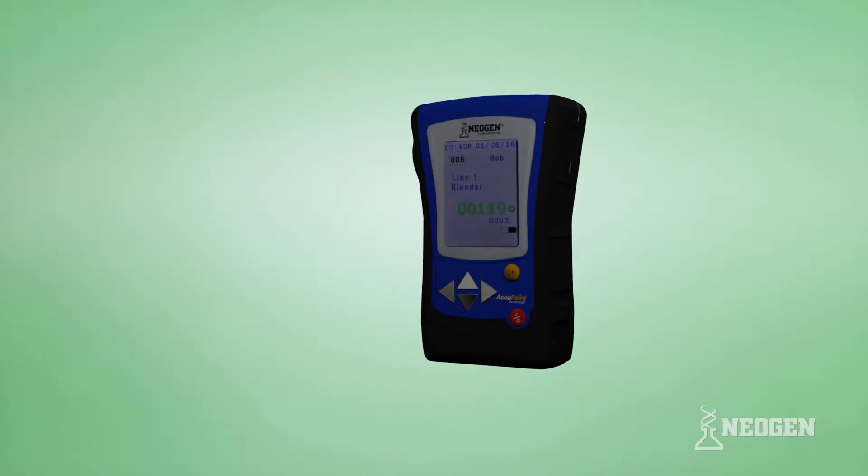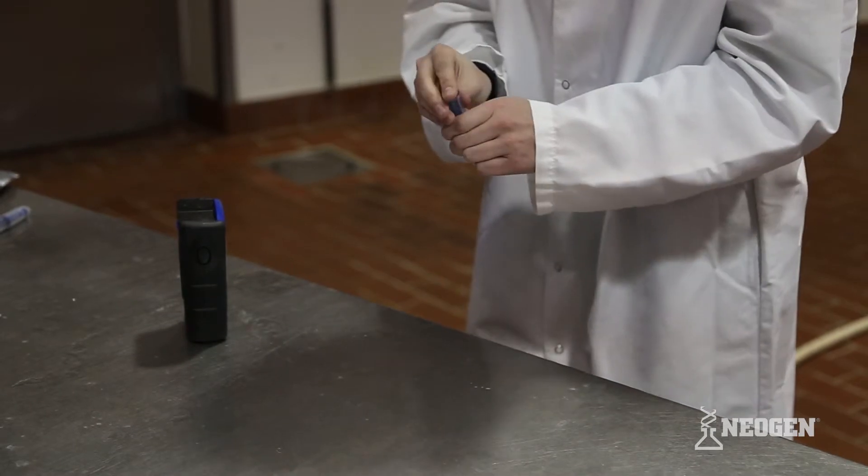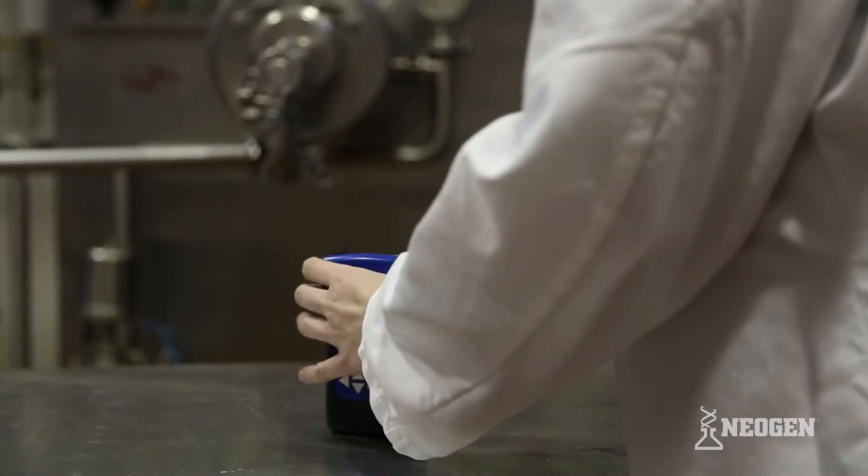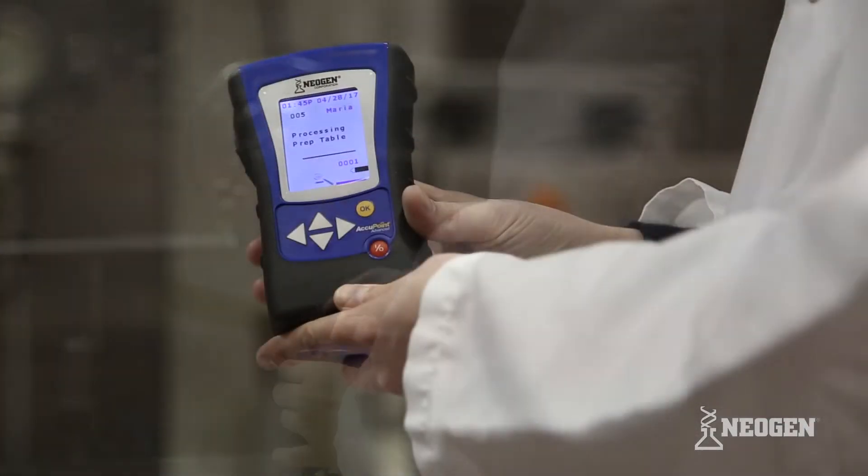This is measured by the system's reader. The Accupoint Advanced System helps to quickly verify that surfaces are truly clean by providing ATP detection results in less than 20 seconds.